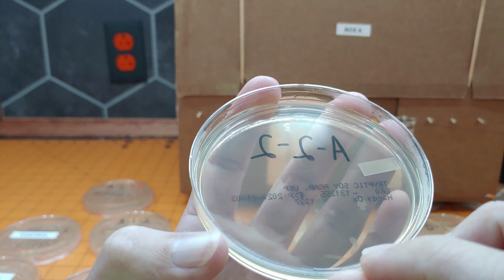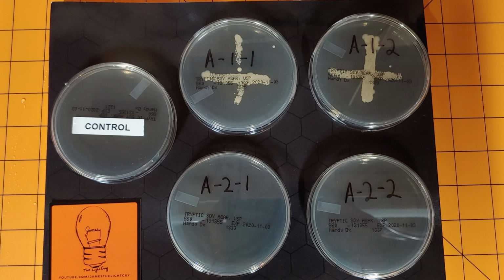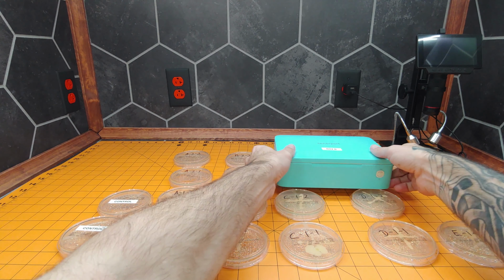Actually, it looks like after 3 days we may have had something starting to try and grow. But again, that was 3 days. We'll call that a 95% success. All right, let's switch over to box B. Box B was, of course, our center port UV sterilizer box. And we once again have 0 contaminants. A 100% success from center port.